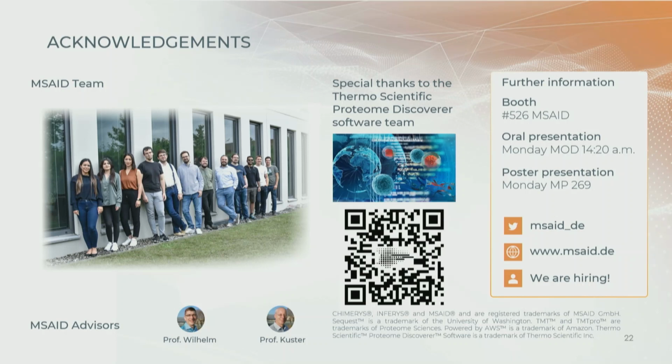Cool, thank you. Sure. Can you provide a little bit more insight into how many fragments are shared across PSMs? Like in the example you showed, it was very nice. Only the Y1 was shared, which makes sense. But how many peaks are typically shared, or how much explained intensity? And do those PSMs then also map to new peptides and proteins, or peptides and proteins that were already identified by more PSMs with more unique peaks? For example, in protein inference, we all accept now that we should use parsimonious approaches, whereas here, in a related problem, we don't do that.